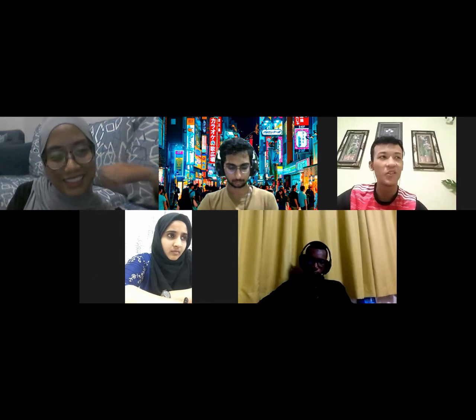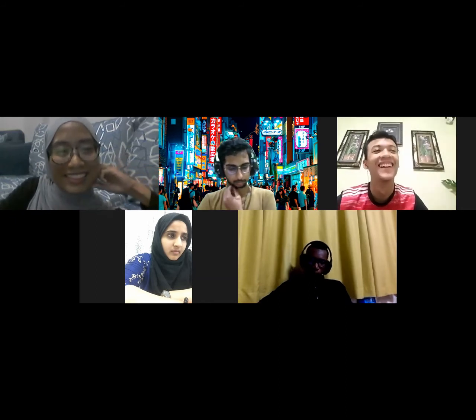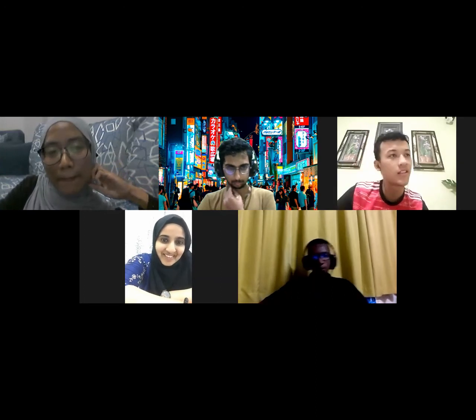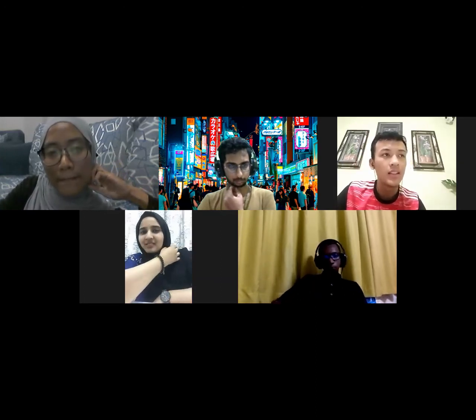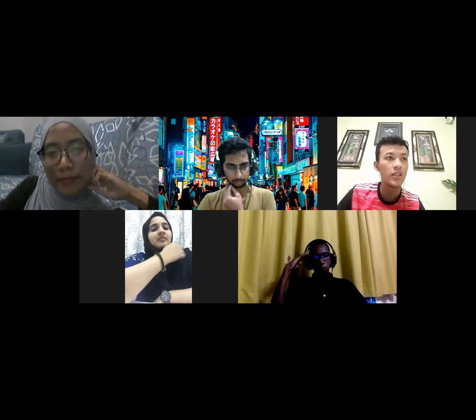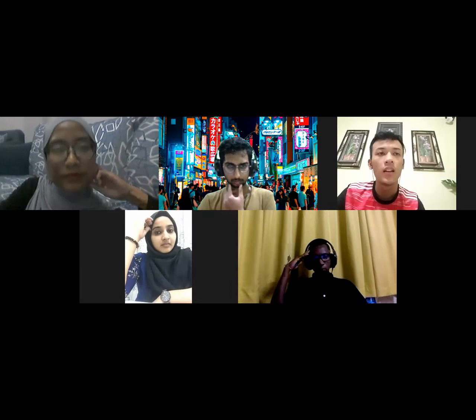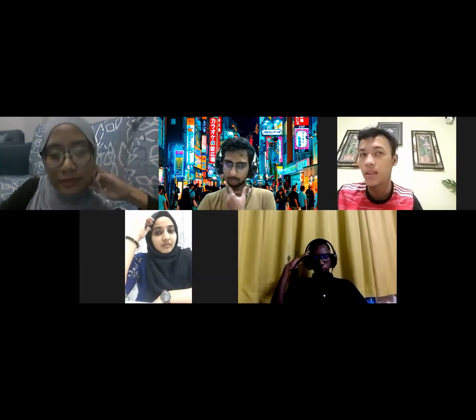Okay, for my primer, for the forward primer, I will just read: ATG GAG AAG GCA GGC TCA TC. And the TM is 59.